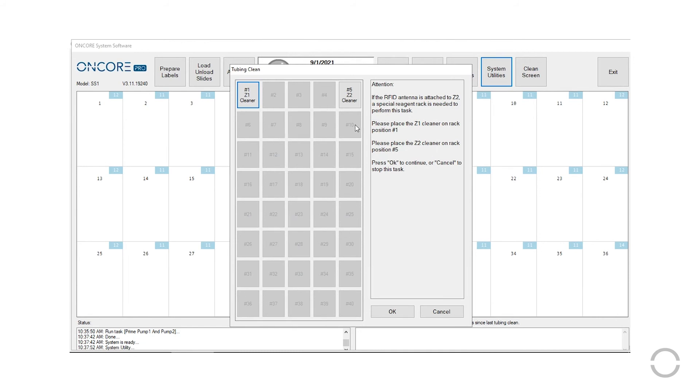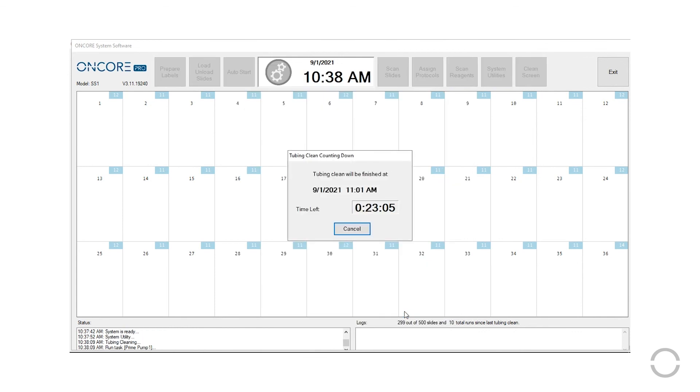The instrument will then ask you to verify that you have loaded both reagents in the appropriate positions. Click OK to begin the protocol. The protocol will run for approximately 23 minutes.